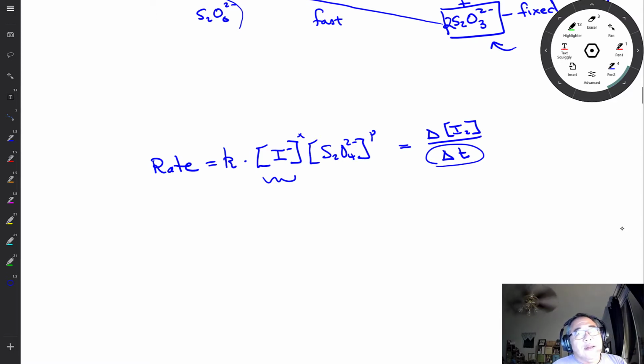And then the third one is really hard to do. But if you add a catalyst, what does it do? It makes the reaction faster. So we're going to try doing this reaction in the presence of a catalyst. And at this point, I can't even tell you, when you do these experiments, you don't really know how efficient the catalyst is going to be unless you do lots and lots of experiments. So you'll have to watch the video and try to figure out, did the catalyst make a difference? Was I able to measure the increase in the rate caused by the catalyst? Those are the kind of questions we'll be answering at the end of this lab in the write-up.